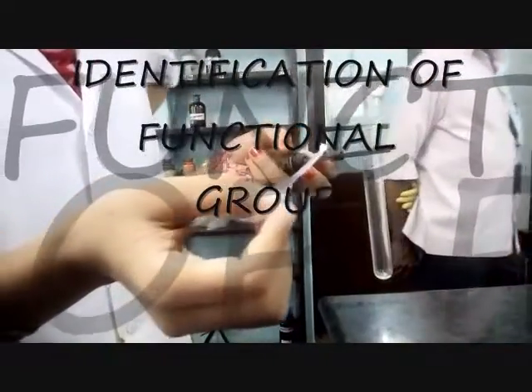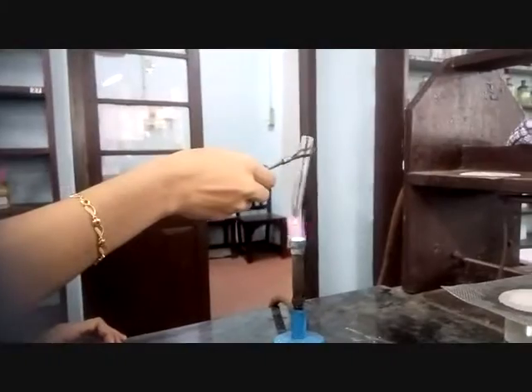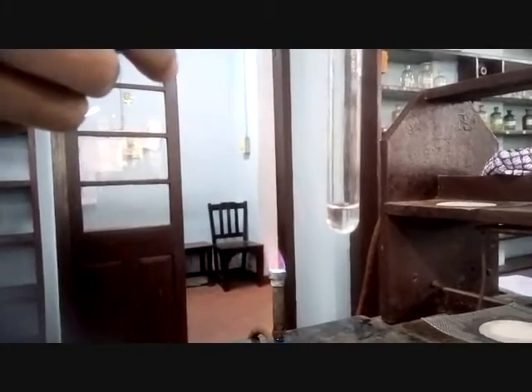Identification of functional group. Action with NaOH solution. Add NaOH to a little of the compound and then boil. The substance dissolves. The compound may be glucose or urea.